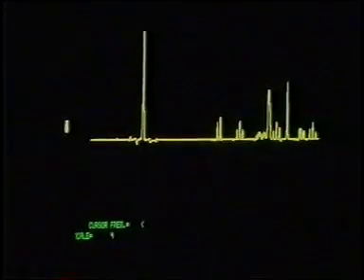Incidentally, this large off-scale signal is due to water, strictly HDO, formed mainly by the exchange of sucrose hydroxylic protons with the D2O solvent. This exchange process also explains why we don't see protons of the individual hydroxyl groups of sucrose in the spectrum. The NMR spectrum of sucrose would not appear like this when recorded on any NMR instrument.